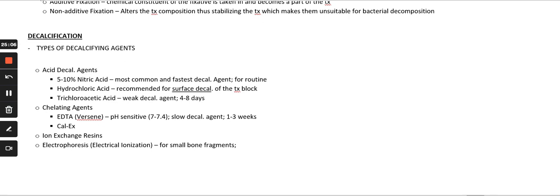It is composed of 88% formic acid, concentrated HCl, and distilled water. So that is its composition. Again, 88% formic, concentrated HCl, and distilled water.